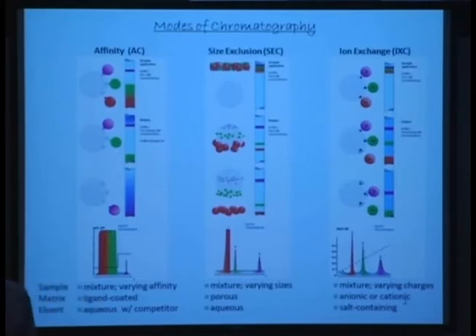Can we use a desalting column? You can use a desalting column, absolutely. The efficiency of those columns is high, more than 90%, but you still lose if you are collecting, as he said, and which is why he keeps saying that I can give you microgram quantities.